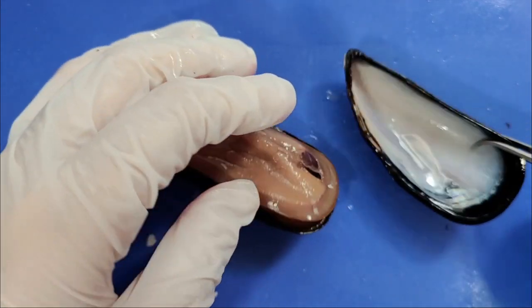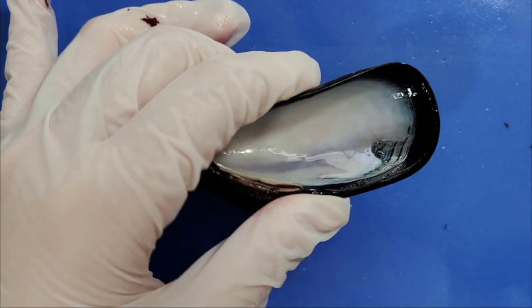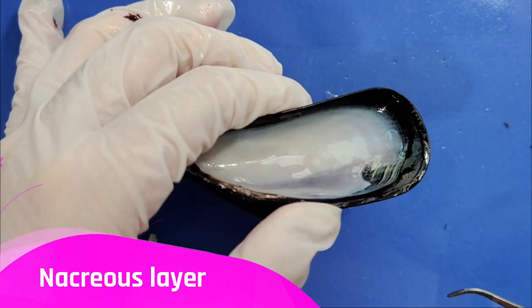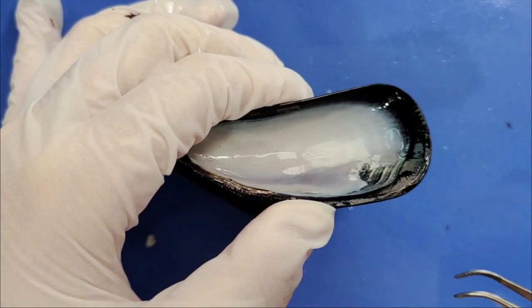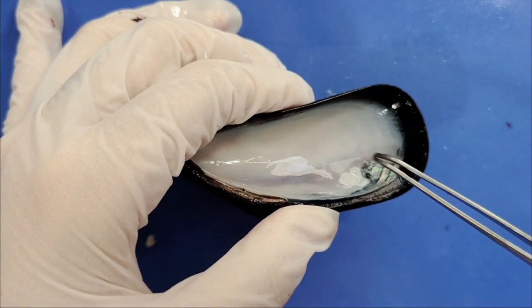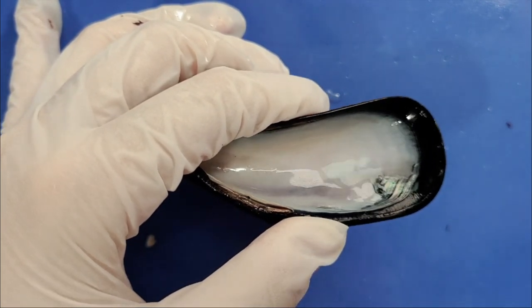Here you can see that the inner surface of the shell is very shiny. This is called the nacreous layer, also called the mother of pearl. When some debris gets caught in a mussel, the same material that made this layer coats that debris, forming a pearl.